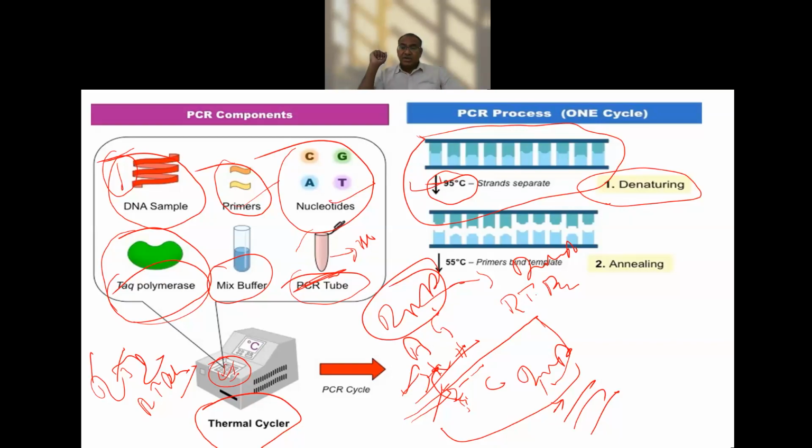At 95 degrees, a specific protein or specific DNA molecule will have one set temperature of denaturation. In this case, we are using DNA here. I can do the denaturation of the DNA at the level of 95 degrees. Got the point here? This is very important for us to understand.